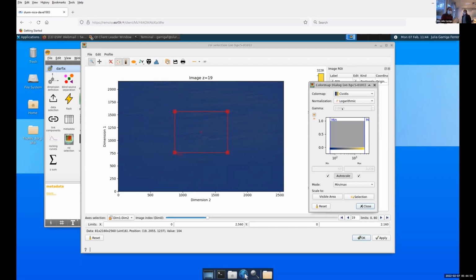Actually, since you don't have a lot of images, it won't take a lot of memory and it won't be very long if you don't do the region of interest. But for the learning course, it will be. So now we don't have a lot of time. Normally, you wouldn't apply any region of interest, I would think, if you want to use all the data. And if you only have 80 images, you can.